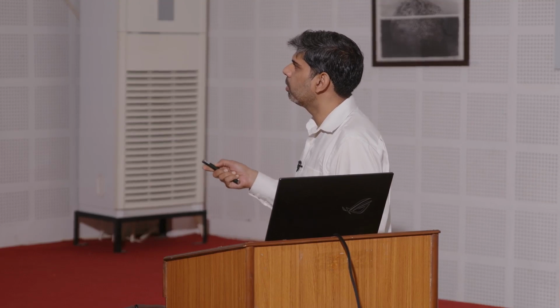That is the amount of liquid that we need, and we can develop portable instruments where this can go in as a cartridge and you can do your sample testing in the field rather than bringing the samples to the lab. So, this field holds a lot of promise, and microchip electrophoresis is one of the significant successes of microfluidic technology, which has seen commercialization and is already in the market.